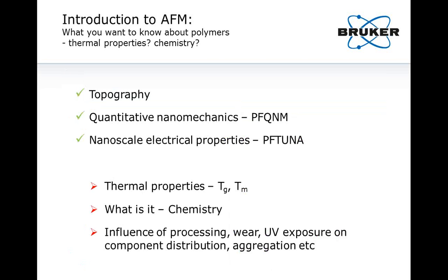And so with AFM really becoming a tool for not just nanoscale topography, but also quantitative mechanical and electrical characterization of soft samples, of polymers, really the next very important parts of interest are characterizing these kinds of samples thermally: thermal transitions, Tgs, melting points, and of course also, as part of that, answering the question, what is the material under the tip, the chemistry? And with AFM as an ambient probe, conveniently doing that as a function of environment, or of exposing the sample to different environments of processing, UV exposure, etc.